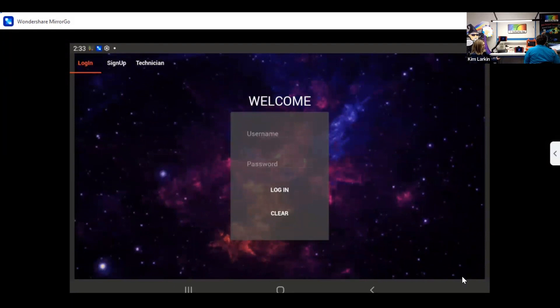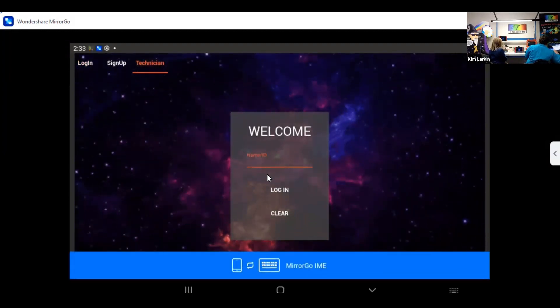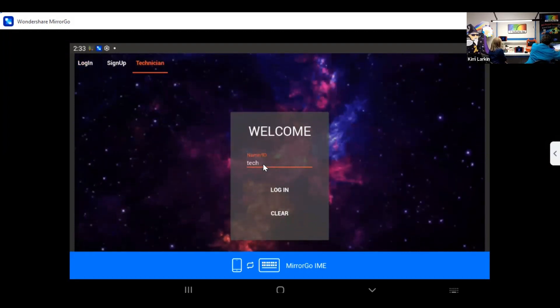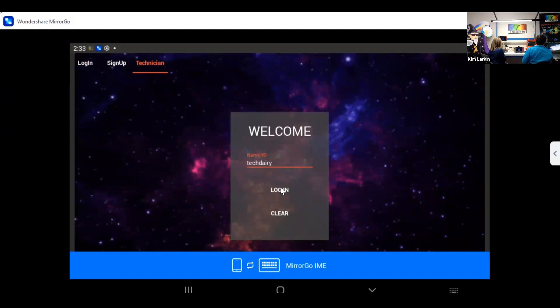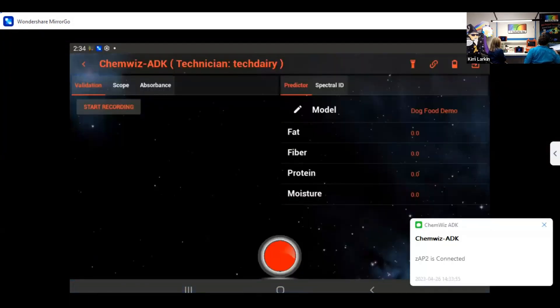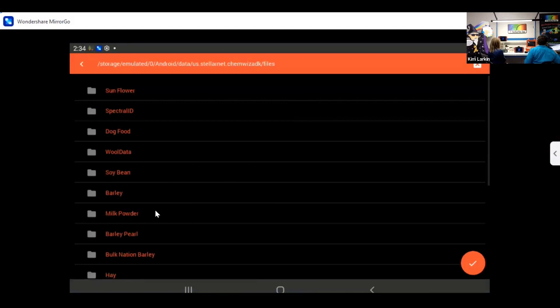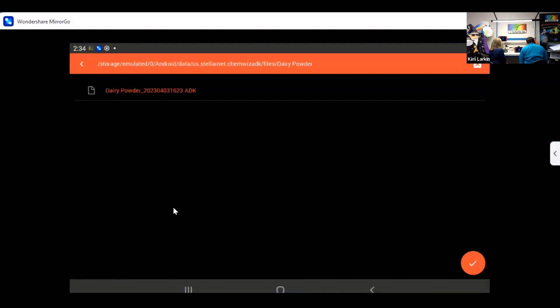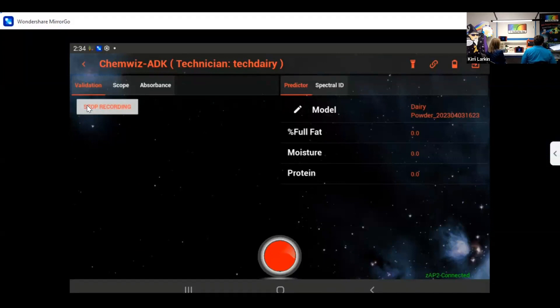This is the login for our ChemWiz ADK software. We are going to log in as the dairy technician. You can see this is one of our previous calibration models loaded. As a technician, I just have to choose between the models available to me. I'm going to go ahead and load our dairy powder model — dairy powder ADK — and it's going to measure the fat, moisture, and protein in the sample. I'm going to start recording my session.